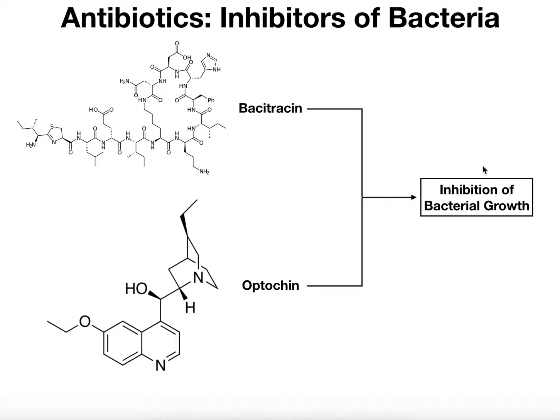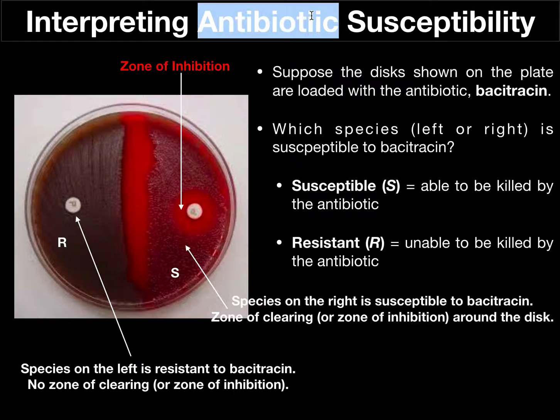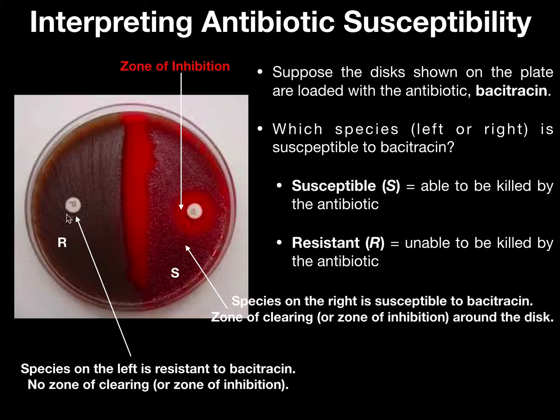Susceptible means that the bacteria is able to be killed or inhibited by that antibiotic. So we're going to have two results in this first video: either resistant or susceptible. Now let's look at the actual test. Here we're doing a simple interpretation of antibiotic susceptibility. I have a plate — on the left side I have one species, and over here on the right I have a different species.